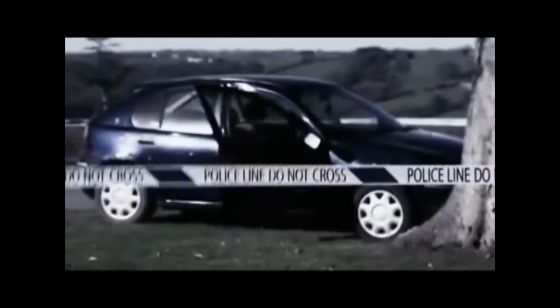A stolen car has been found abandoned after a hit-and-run incident. But it's not for real, it's a mock-up designed to put me to the test. My task is to gather hair and fibres from inside the car. I'm hoping these will help me pinpoint the thief from our volunteer suspects. Helping me is CSI tutor Paul Deering.